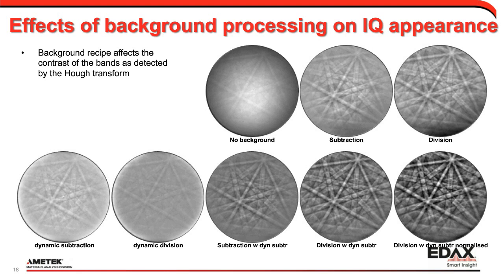Actually, we just got a good question here on slide 17. What is your target? It's kind of a moving target of how many. Slide 17 is the one with the amount of backgrounds.